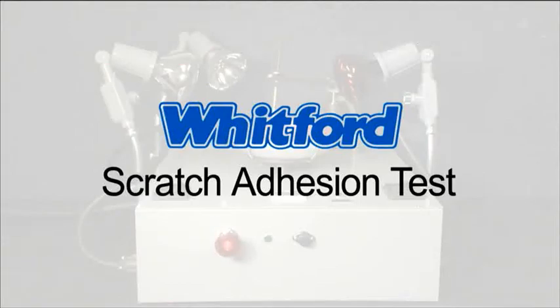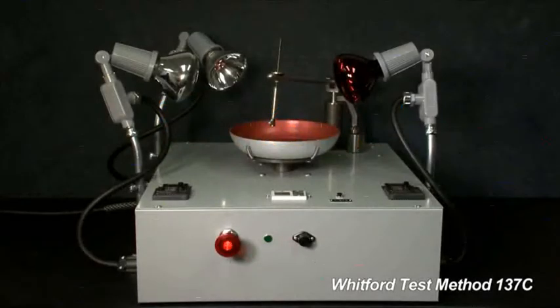This is Whitford's Scratch Adhesion Test, a machine that measures resistance to scratching at cooking temperatures.